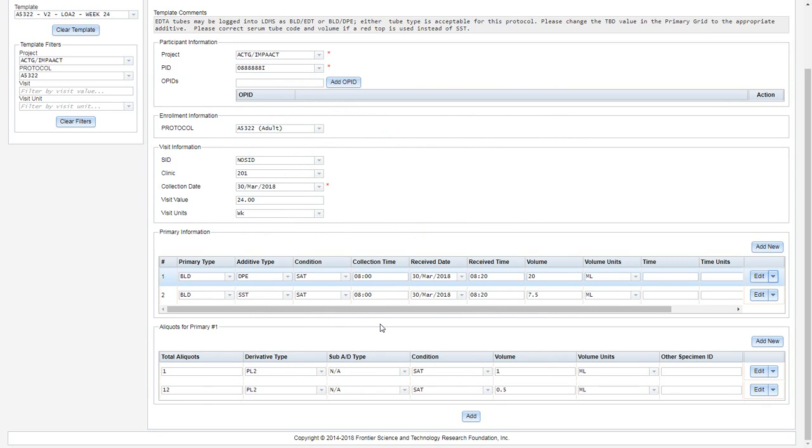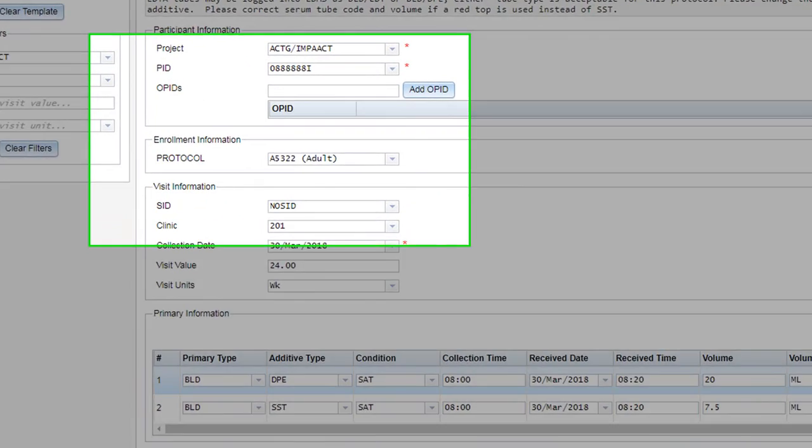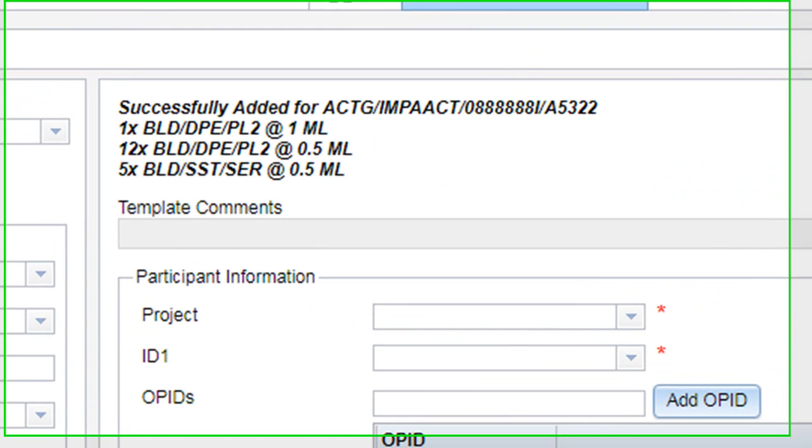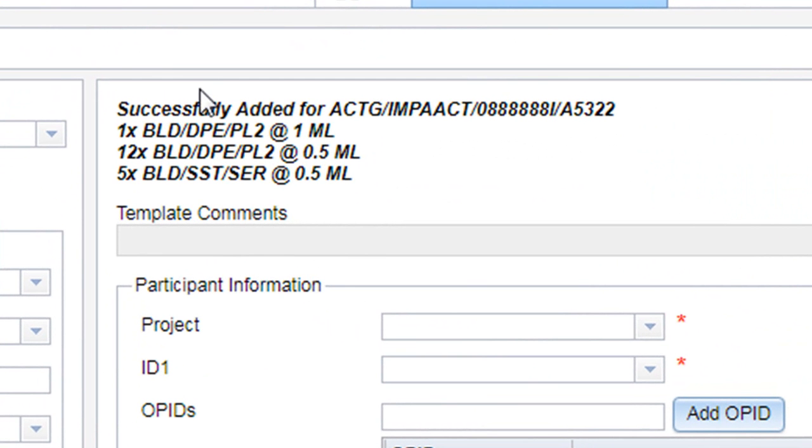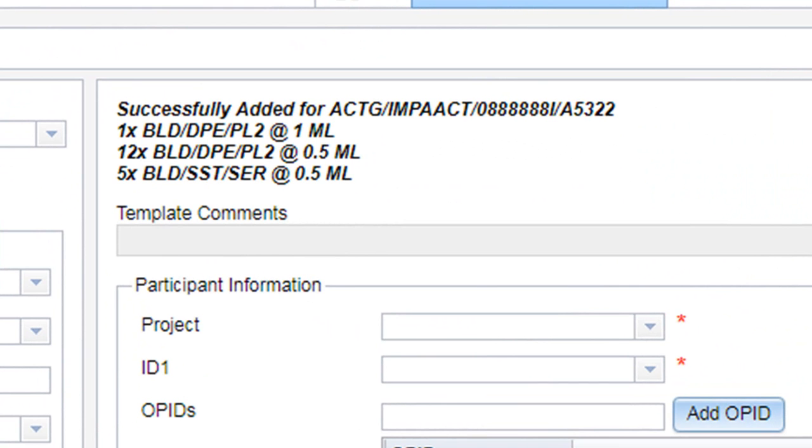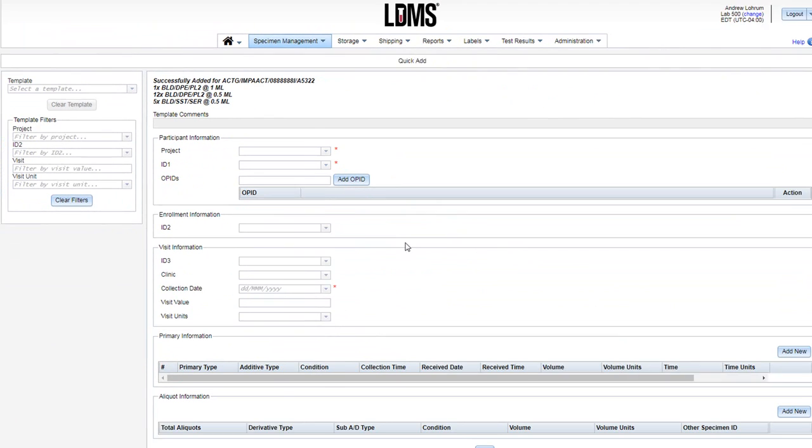This record has enough information for me to add it into our system, and you do that by clicking the add button in the bottom center. I have a success message, and each of my aliquots are enumerated in the list. The form has now reset, and I can add another set of specimens.